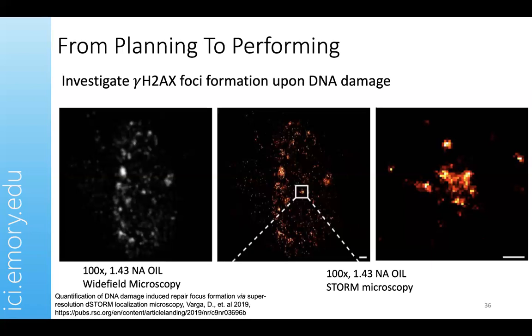If your drug is doing extensive damage to the nuclei, depending on how the DNA damage machinery is responding, the number of gamma H2AX foci may vary, right? So all of these questions depend on your cell type and how much damage you are getting. And then you can think of what kind of microscope I should be using based on my questions, okay?